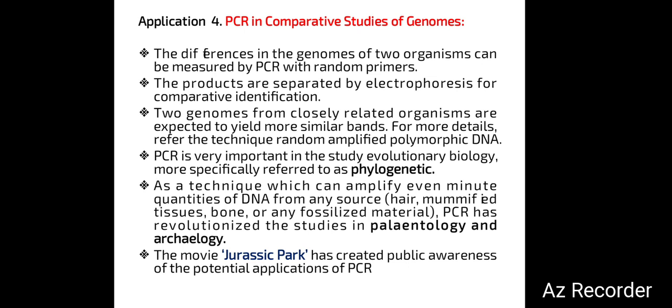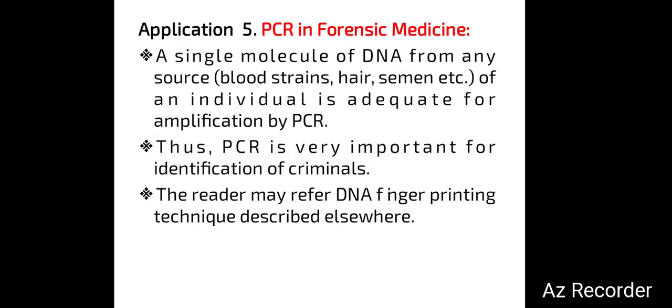Fifth application, PCR in forensic medicine. A single molecule of DNA from any source, from blood stains, hair, semen, etc. of an individual is adequate for amplification by PCR. Thus, PCR is very important for identification of criminals. The reader may refer to the DNA fingerprinting technique described elsewhere.